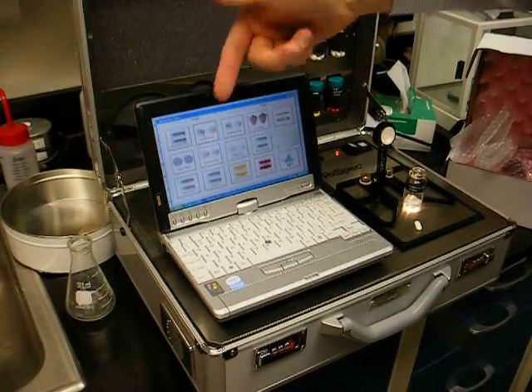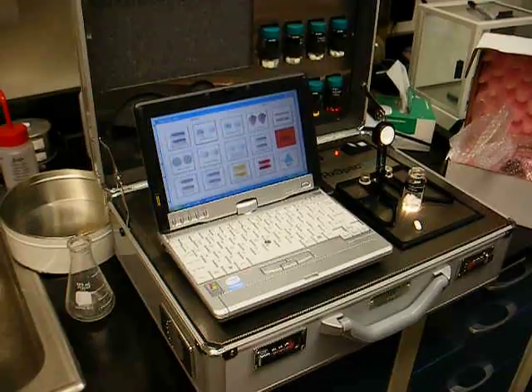If we select the wrong pill, see that the product will fail the analysis.